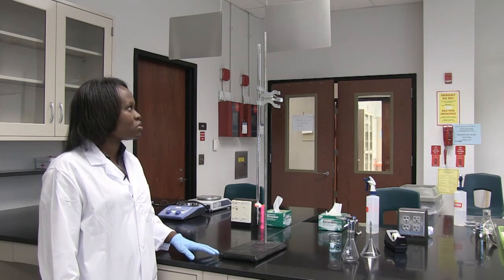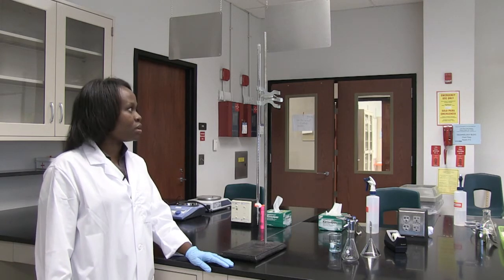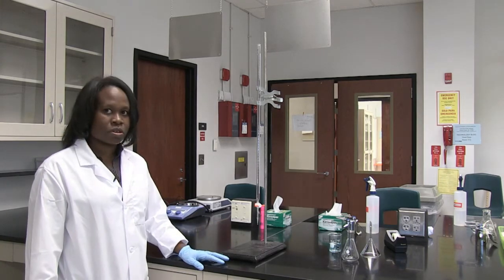As part of your first lab, you're going to be doing basic measurements, and you're going to be using some basic lab equipment to test the accuracy of certain glassware. So I'm just going to introduce you to certain techniques and to the use of certain instrumentation that will help you do this lab as accurately as possible. So first, I'm going to introduce you to how to use a burette.